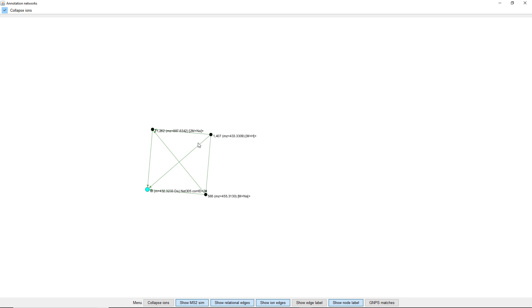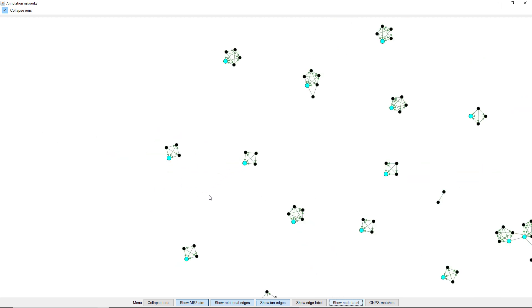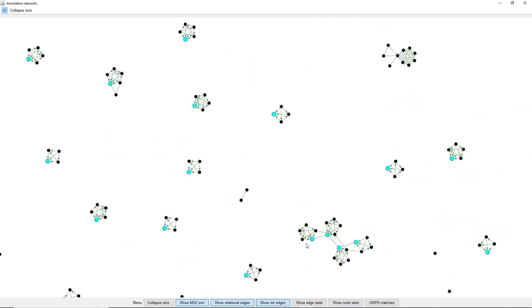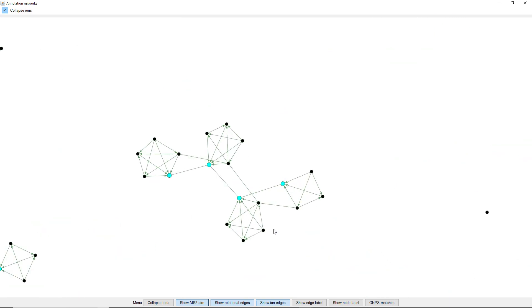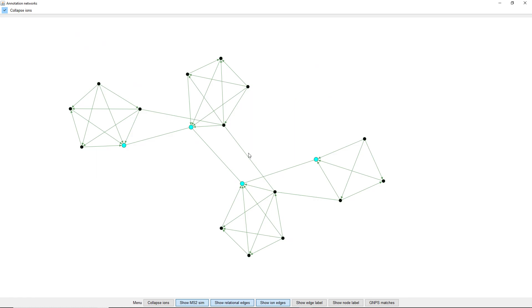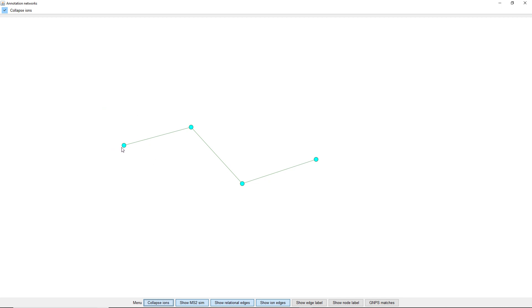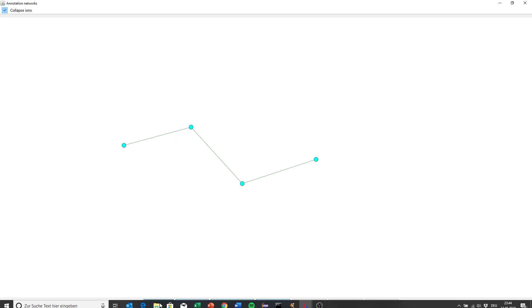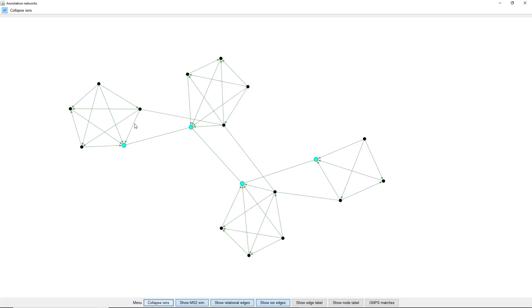So we decided to remove all of those redundant ions when we collapse, and then only show the cyan dots. We can get rid of the labels just for clarity. In these smaller networks we can see different edge types. We can collapse the network and now we see only four neutral molecules, whereas if we don't collapse, we have multiple features — multiple ions — but only four neutral molecules.